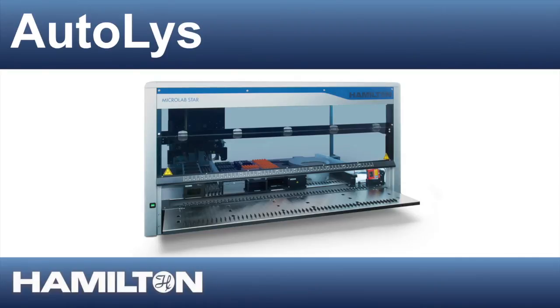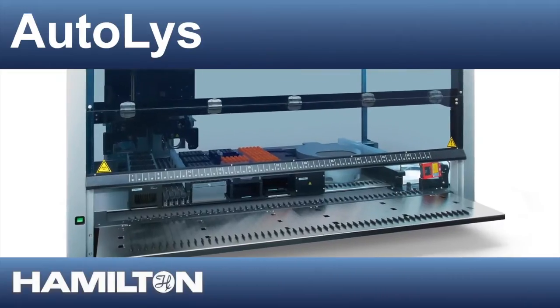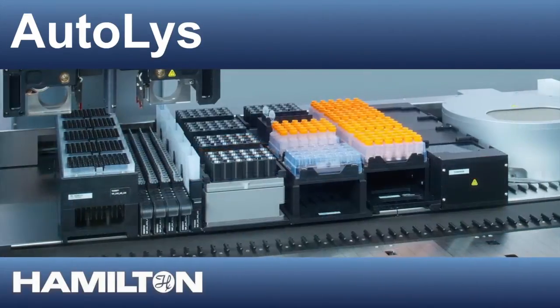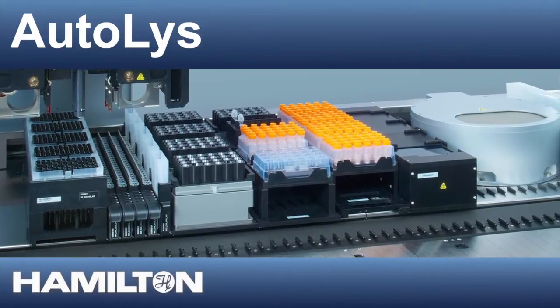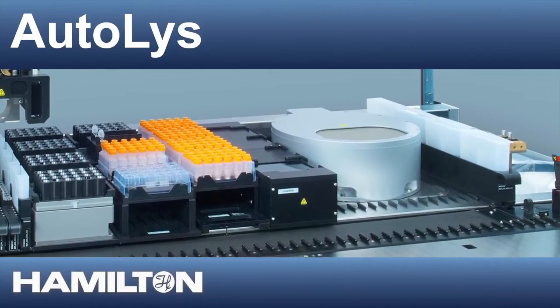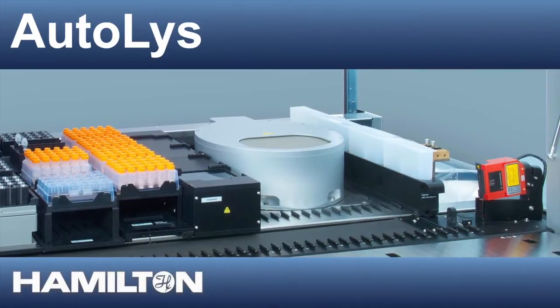Discover the Autolis Workstation, one of the new generation of smart automation solutions from Hamilton Robotics. The Autolis Workstation is the first fully automated and compact system to automate the complete sample lysis and DNA purification process, thus removing the last remaining bottleneck of the DNA purification process.